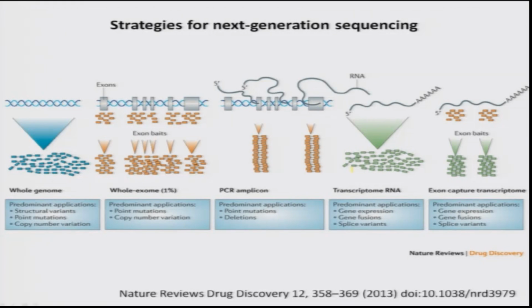One of course is the whole genome sequencing, so you can sequence the entire genome using this method. Or it could be what is called the whole exome sequencing, meaning you do not sequence the entire genome. If you are looking at a disease, it is likely that the disease is caused by a defect in the coding sequence. So what you do is you select the regions that code for the genes, the protein coding sequences. Therefore, you selectively enrich these regions and then sequence them.